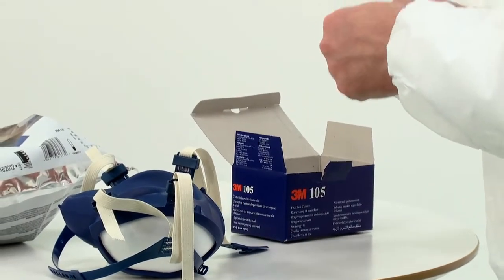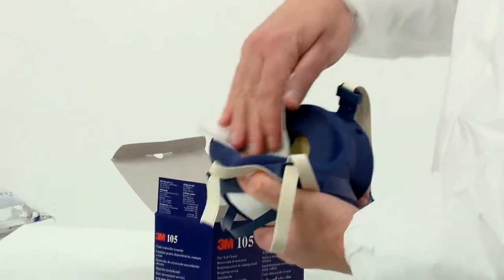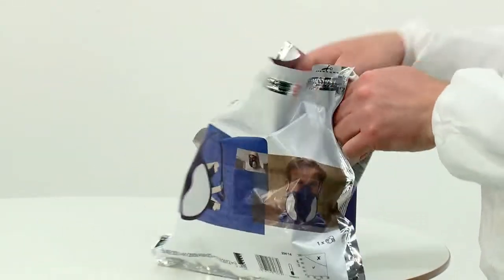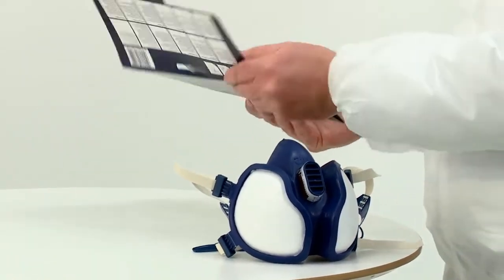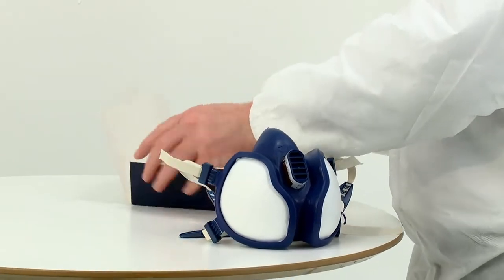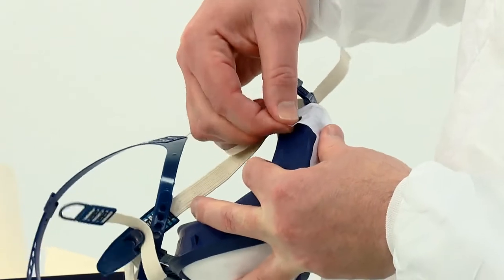The respirator should be cleaned at the end of each shift, dried at room temperature and stored in the original packaging or a sealed container. If you are using the optional 3M 400 overspray guard to extend the life of your particulate filters, place the holes in the guard over the 4 lugs on the respirator. Ensure the overspray guard is the right way up and that there are no folds or wrinkles.